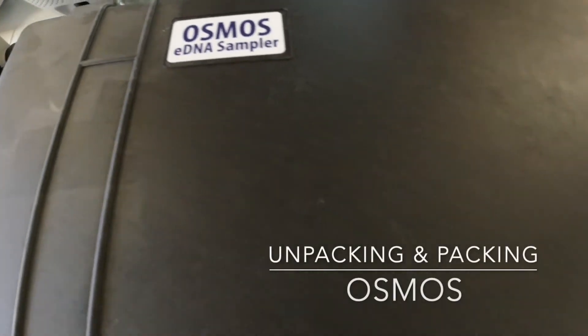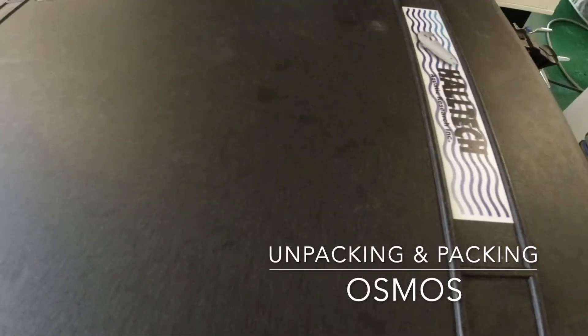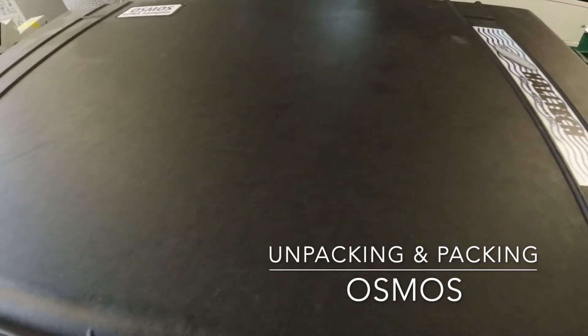This is a quick video to go over the Osmos eDNA sampler, specifically for the field sampling components.